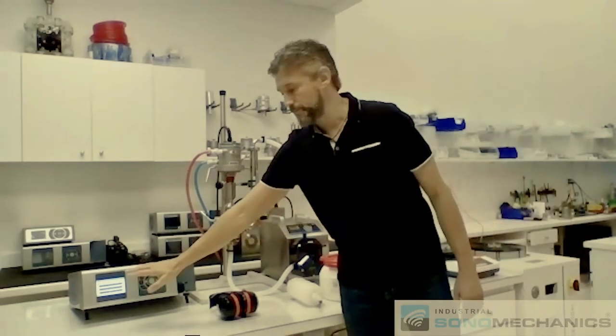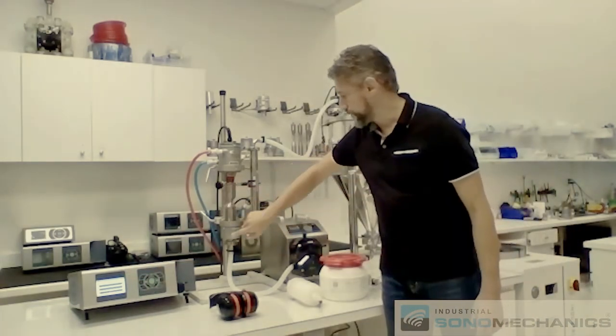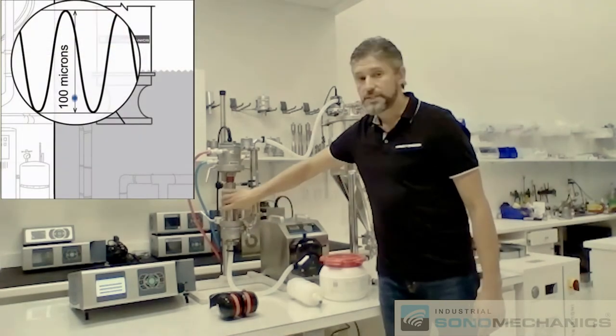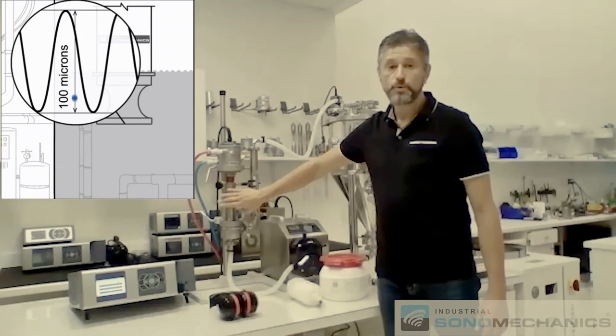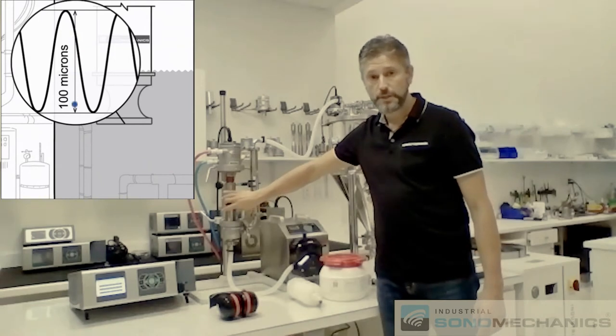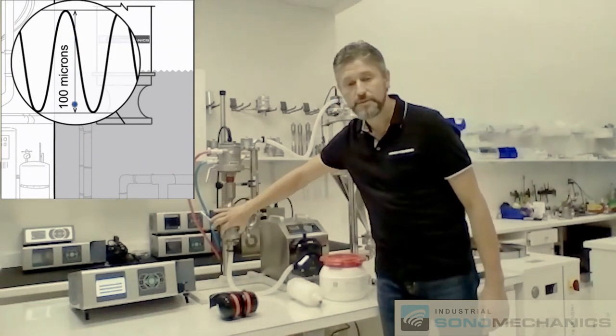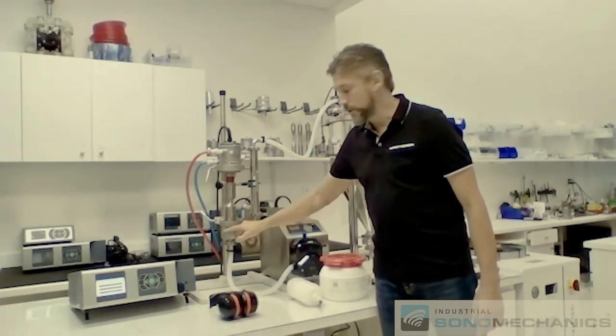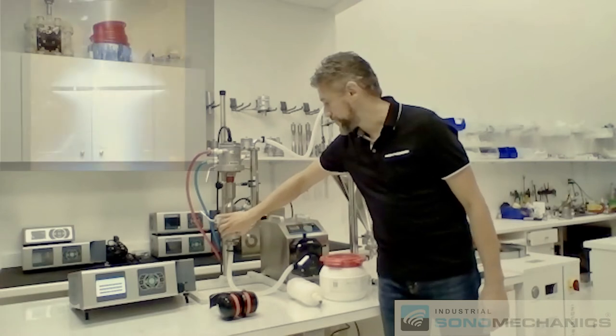you can turn on the sound. The barbell horn, which is inserted into the flow cell or this reactor chamber, will activate. This barbell horn can provide up to 100 microns peak-to-peak of sonic amplitude and it has a 45 millimeter diameter tip, which creates an extremely high acoustic cavitation inside this reactor chamber.